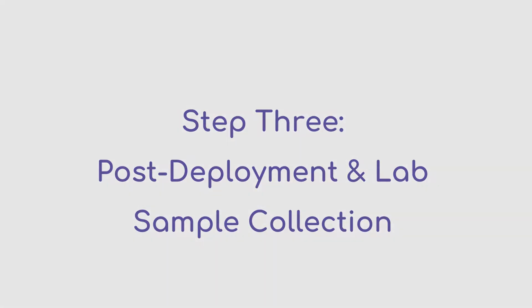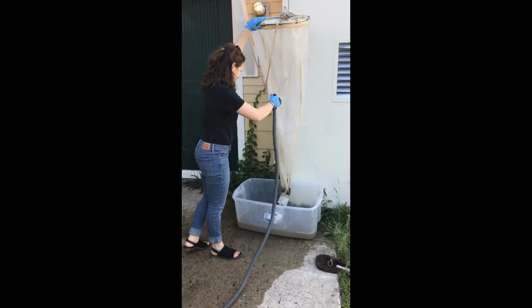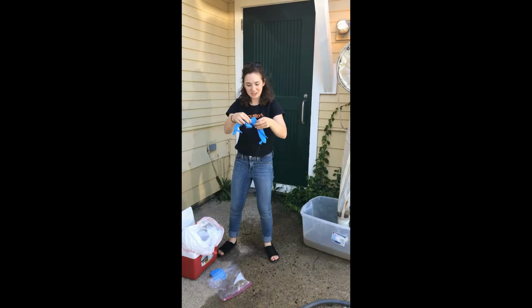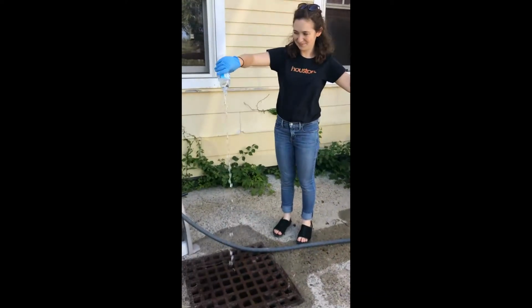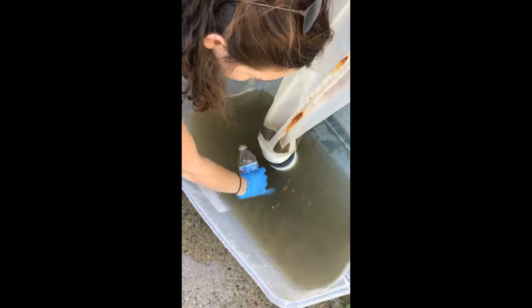And here's the real fun part. We're going to spray off this net. All the little pieces of vegetation, all those little plankton are going to get washed down to the bottom of that net, and the really small ones, as well as just tiny, tiny cells, are going to get washed down into that really dirty rinse water. So the sample we're taking is of the rinse water that's been touching everything, all these things that got caught in the net over an entire hour.